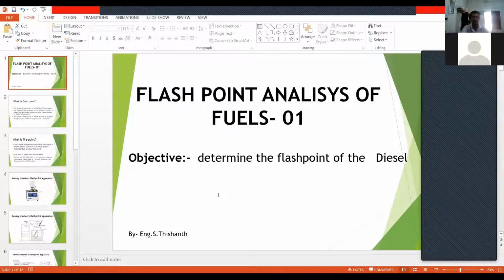They have been divided into two, right? Flashpoint analysis of fuel 1, flashpoint analysis of fuel 2. We are not going to demonstrate separately here, so I prepared a PowerPoint presentation and divided it for two practical sessions. Today is about diesel fuel.